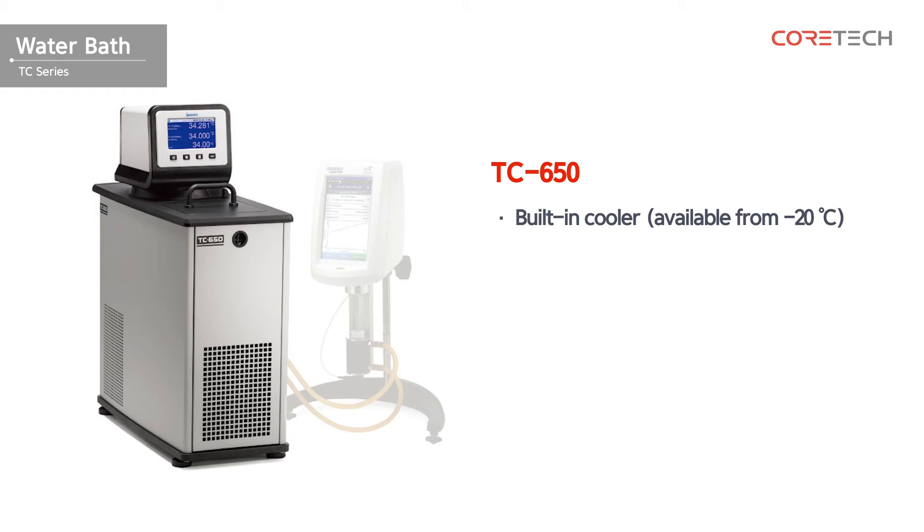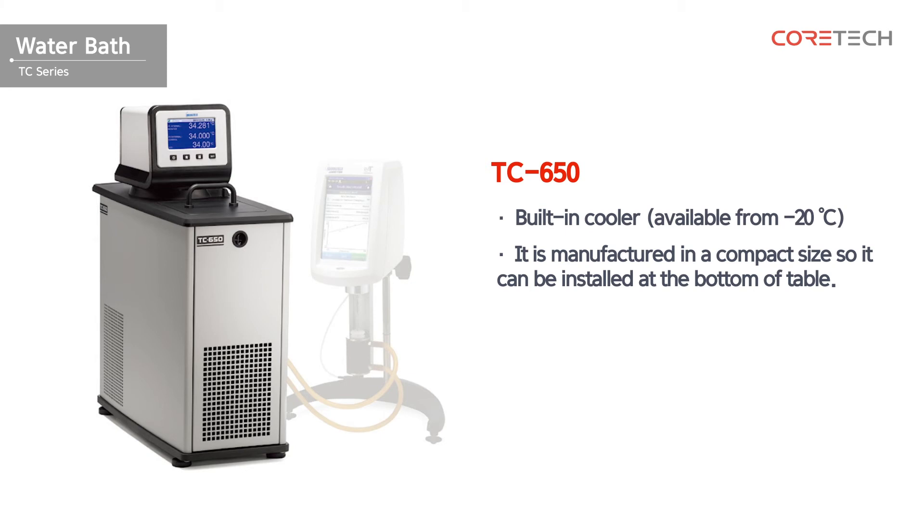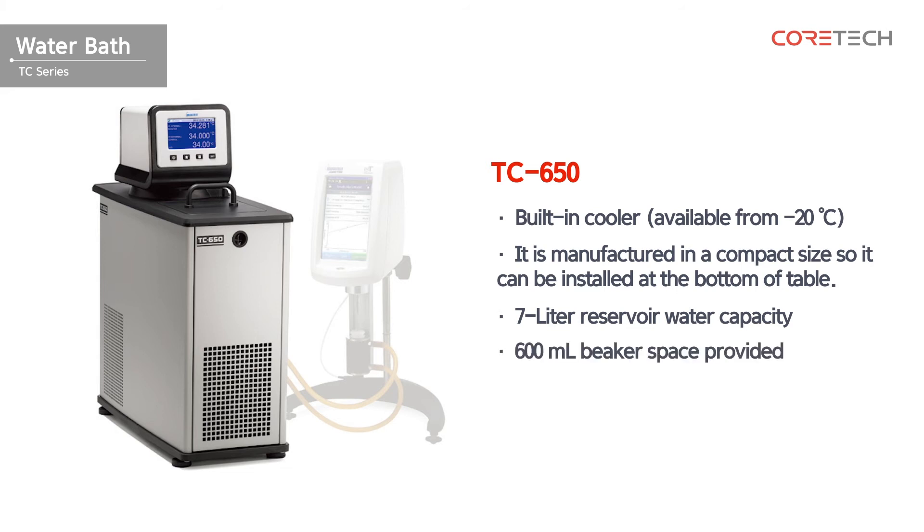This is TC650. It's a low temperature circulating water bath that can be used from a low temperature of minus 20 degrees Celsius. It also has a built-in cooler and is made in a compact size. With a storage capacity of 7 liters, space for a 600 milliliter beaker can be used to measure viscosity directly in the water bath. This model is suitable for external circulation.